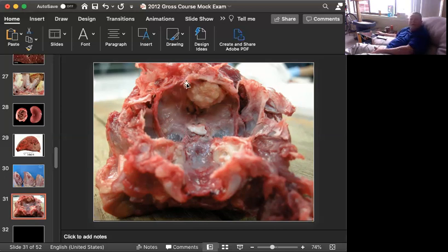As opposed to dogs, these are very benign tumors. They don't act in a benign fashion because of where they're located, but they don't infiltrate the underlying cortex. You can see that in dogs, where they actually are fairly aggressive and can infiltrate into the brain tissue, but not in cats. But they are a problem because of where they are located. So meningioma in a cat, very classic lesion.